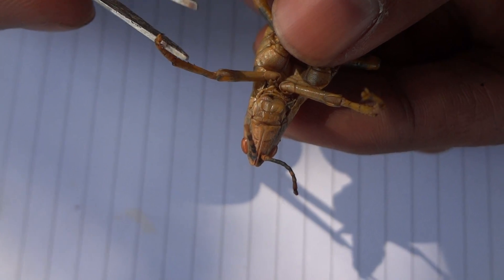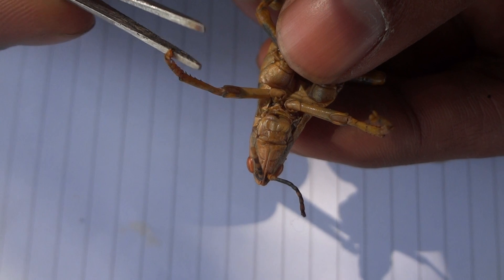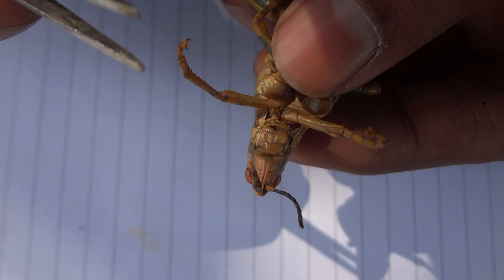Hi, this is Abil Preez and I am from UAF University of Agriculture, Faisalabad, Pakistan. As you can see in my hand, this is a grasshopper and today we're going to dissect its mouth parts.